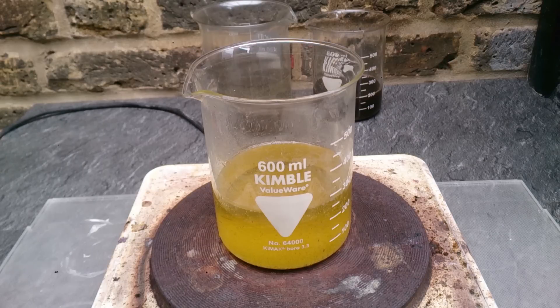Hi guys, yesterday I just finished filming my video about stripping gold in a sulfuric acid electrolytic cell — hopefully it won't take me too much time making it ready and uploading it. The video you see is actually a follow-up, the result of my reverse electroplating, but I decided to make a separate video because this is something different.